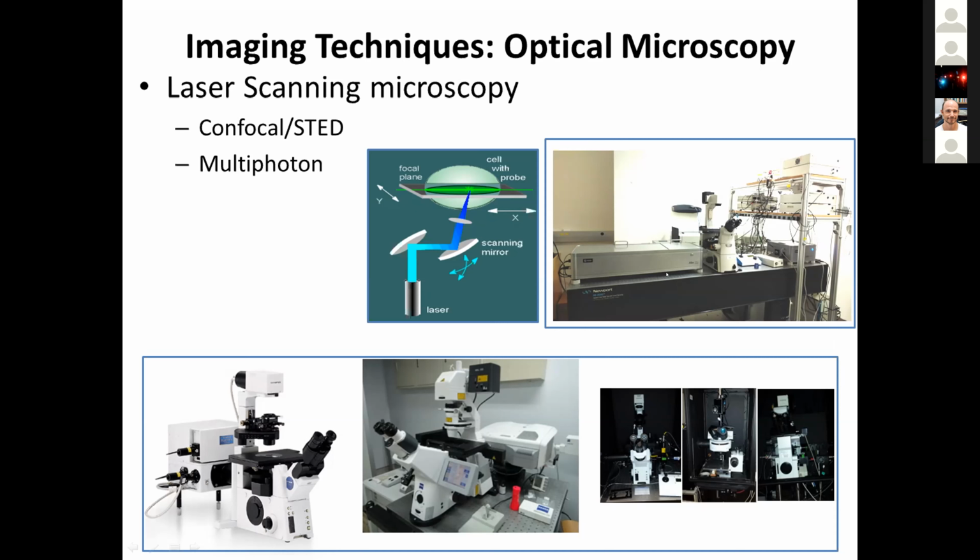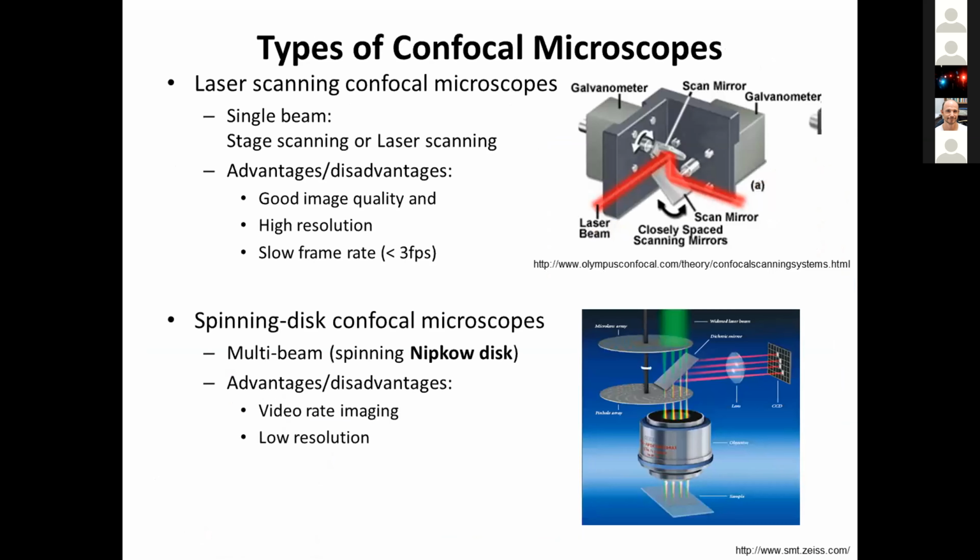So here are different brands of confocal microscope. For example, here is an Olympus, this is a FluoView 1000. The one that we have here is the Zeiss 880, and there are many others. And this is an ALBA microscope for STED that they have at the Laboratory for Fluorescence Dynamics. This is a nice instrument for doing super resolution.